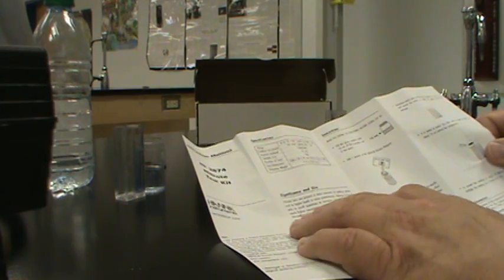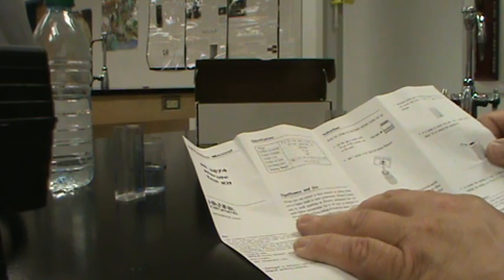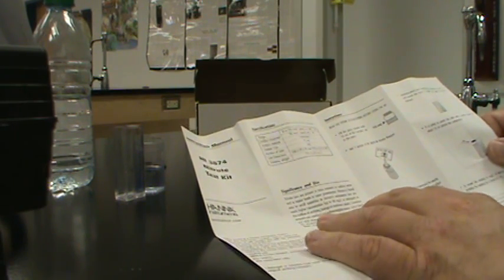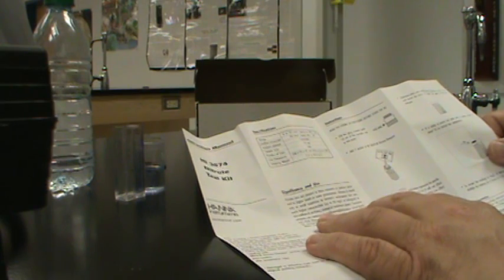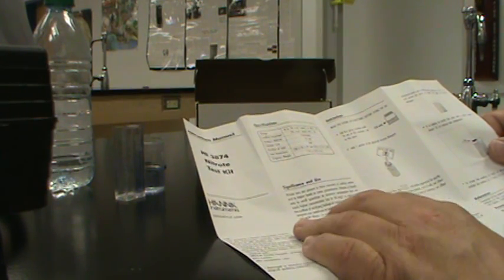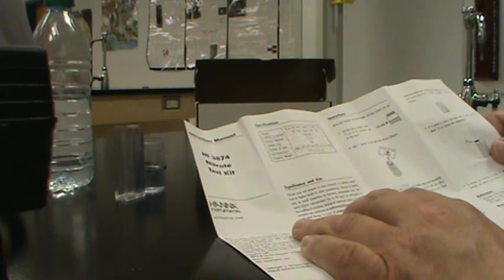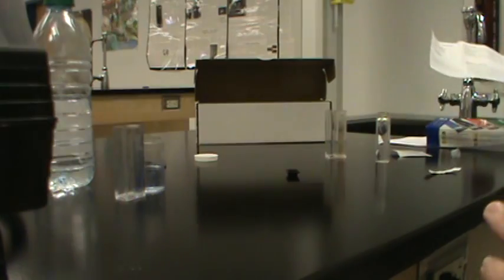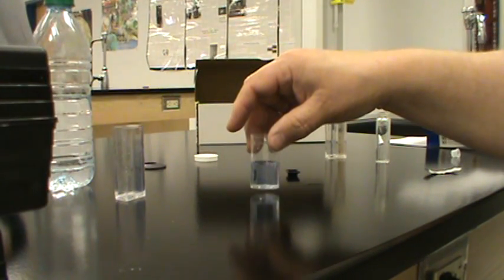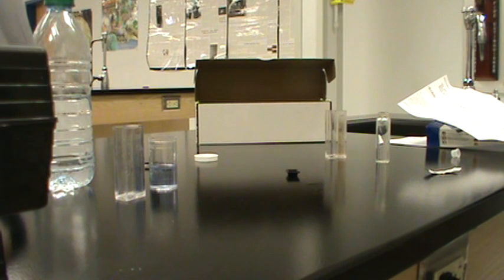Excessive amounts can contribute to infant death and adult illness. In order to prevent this, a 10 milligram per liter limit of nitrogen has been imposed on drinking water. And again, a milligram per liter is the same as parts per million. So we're going to get this one set up because this one requires four minutes. As we see here, we are getting a color change in this one. So we will come back to that in just a moment.